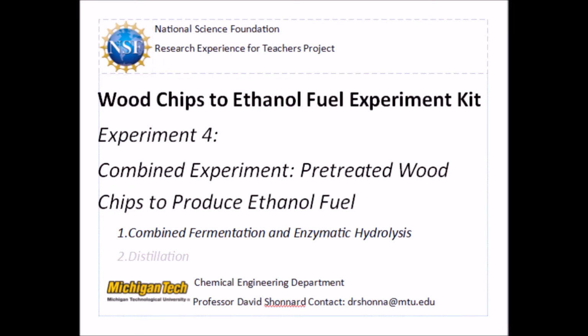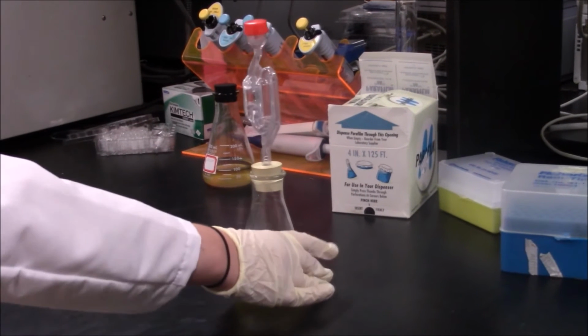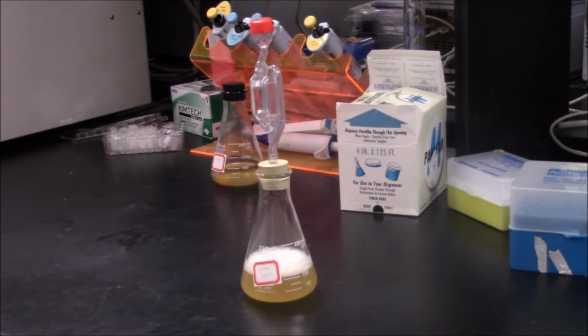During this phase of the experiment, the cellulose in the aspen wood chips is broken down into glucose by the enzymes. The glucose is then immediately consumed by the yeast in a process that produces ethanol, water, and carbon dioxide.